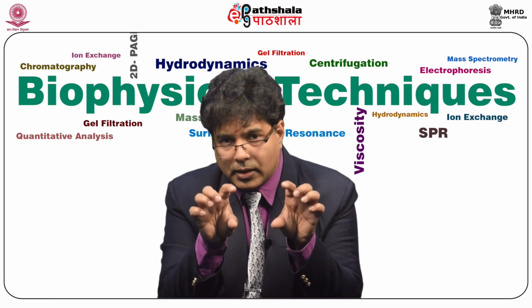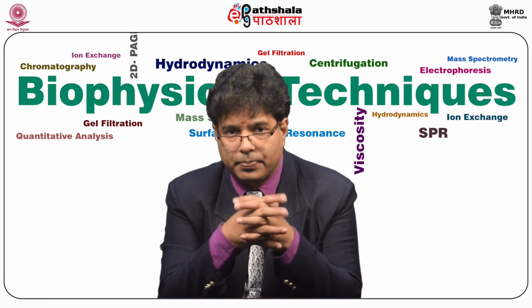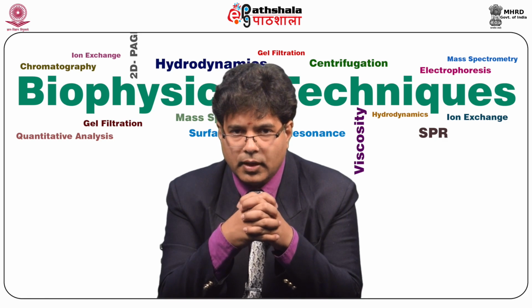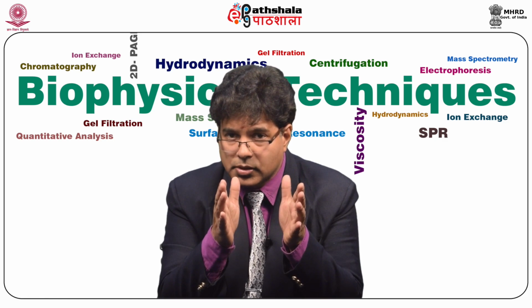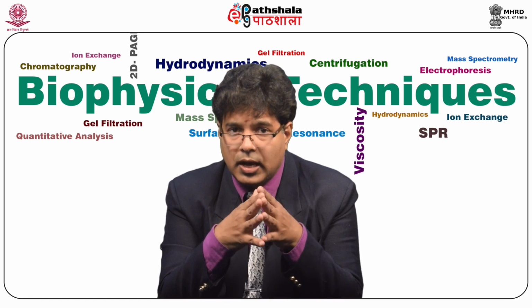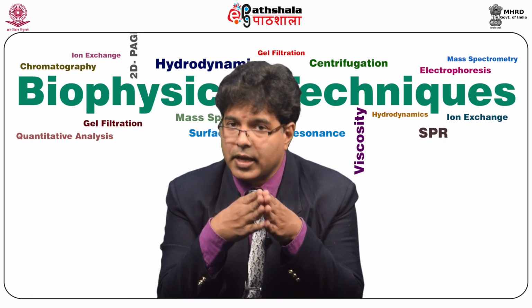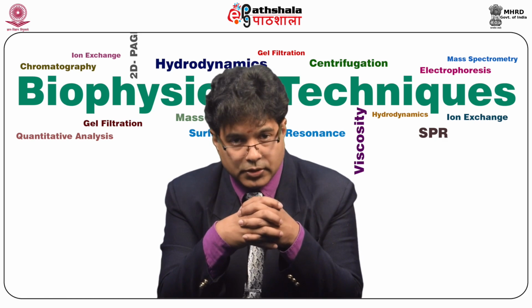But this linear dynamic range of the mass spectrometer is what determines the accuracy and precision. This is limited by physicochemical processes, chemical and sample preparation steps, ionization, and instrument design, the type of mass analyzer and the ion detection scheme involved in mass spectrometers.